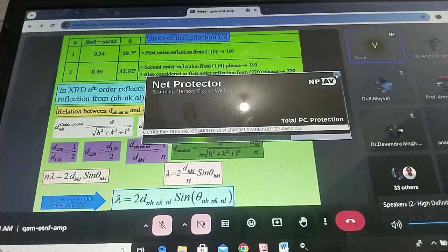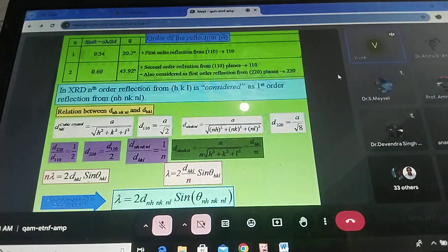No. For graphene as such, we can find out the structure. Powder work I have not done. My expertise is only on single crystal. I have never worked on powder. For any 2D structure, if we can make a monolayer, can we get any information from the X-ray diffraction pattern? With powder diffraction, you can make a thin film of that and then you can get some idea. You cannot go to the unit cell level, but you can get some idea of your unit cell parameters and the interplanar spacing. Anyway, single layer, you cannot make a thin film of only one layer. How is it possible?